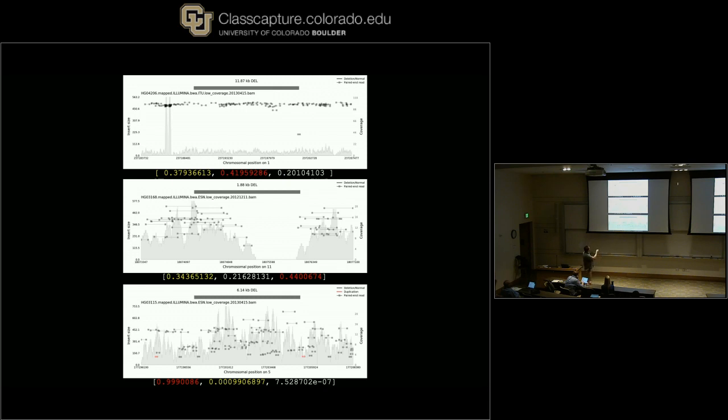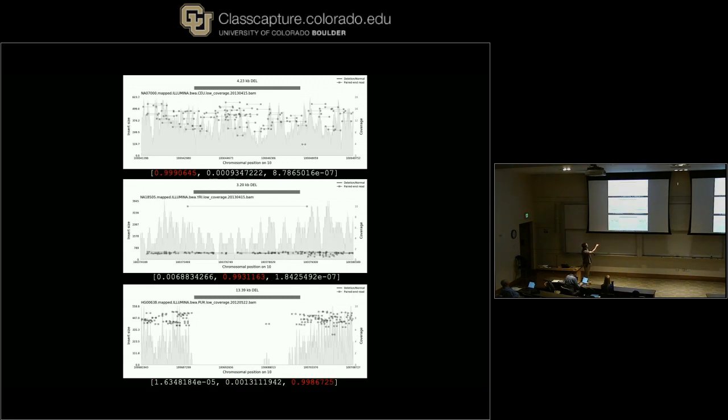Yeah, so you're saying it might be looking right there? I think there's a couple things. You have a big drop in coverage here, and you also have a bunch of junk along the top. And remember, in a lot of these heterozygous cases, the normal alignments are on the bottom and the discordant alignments are along the top, right?